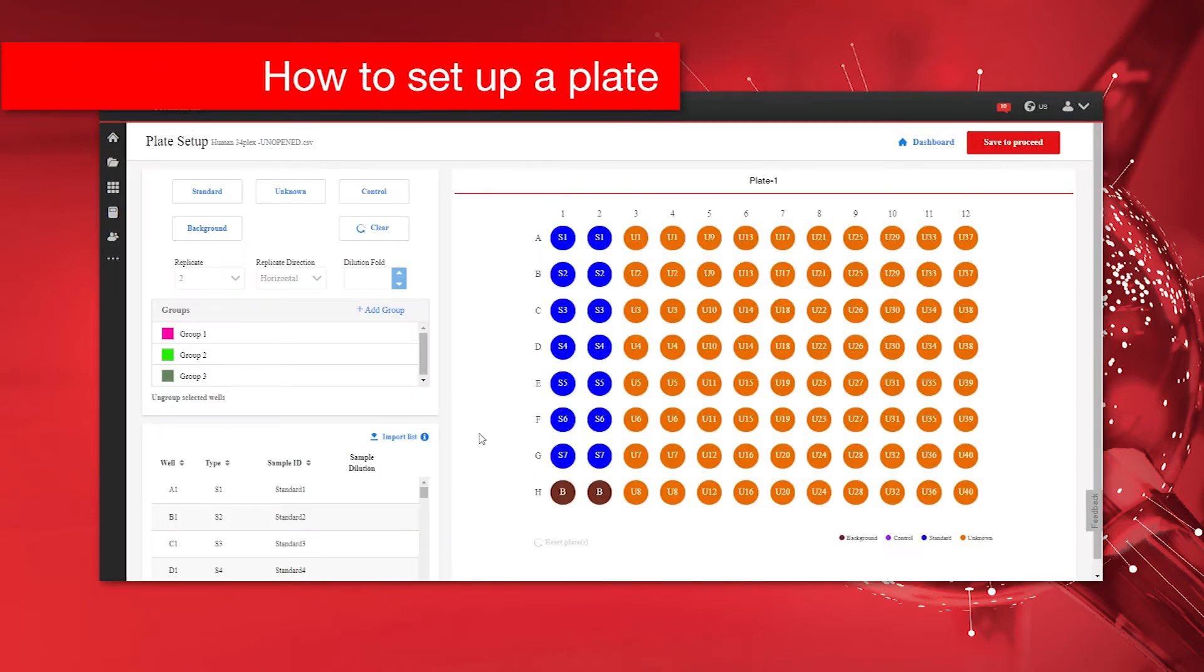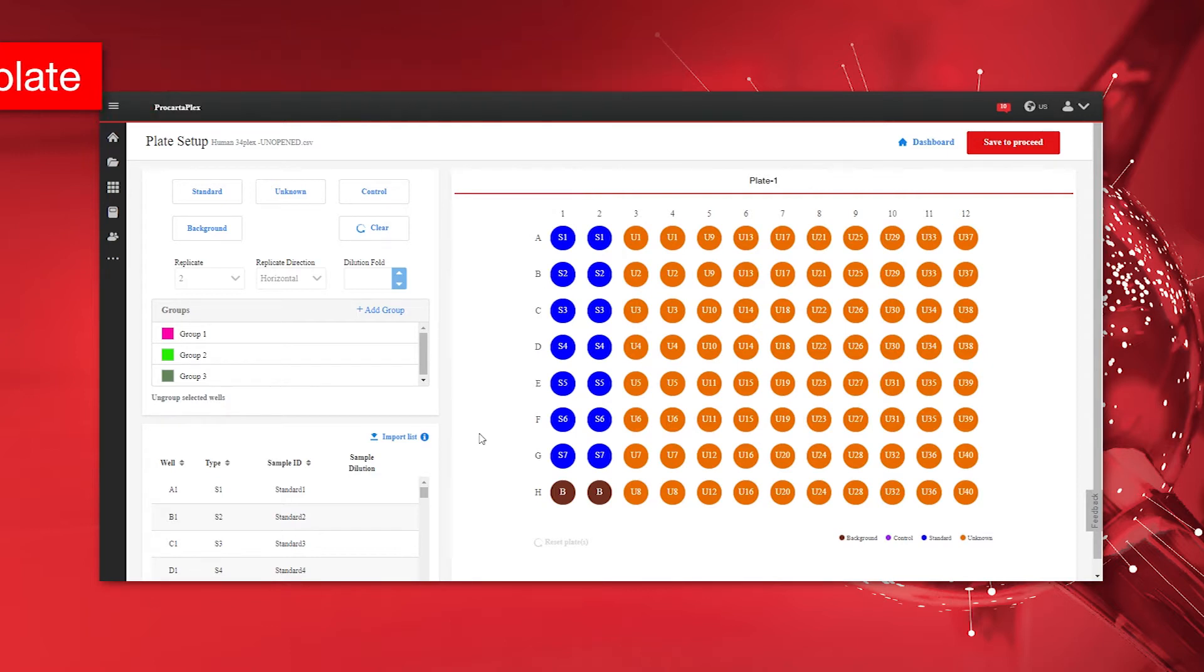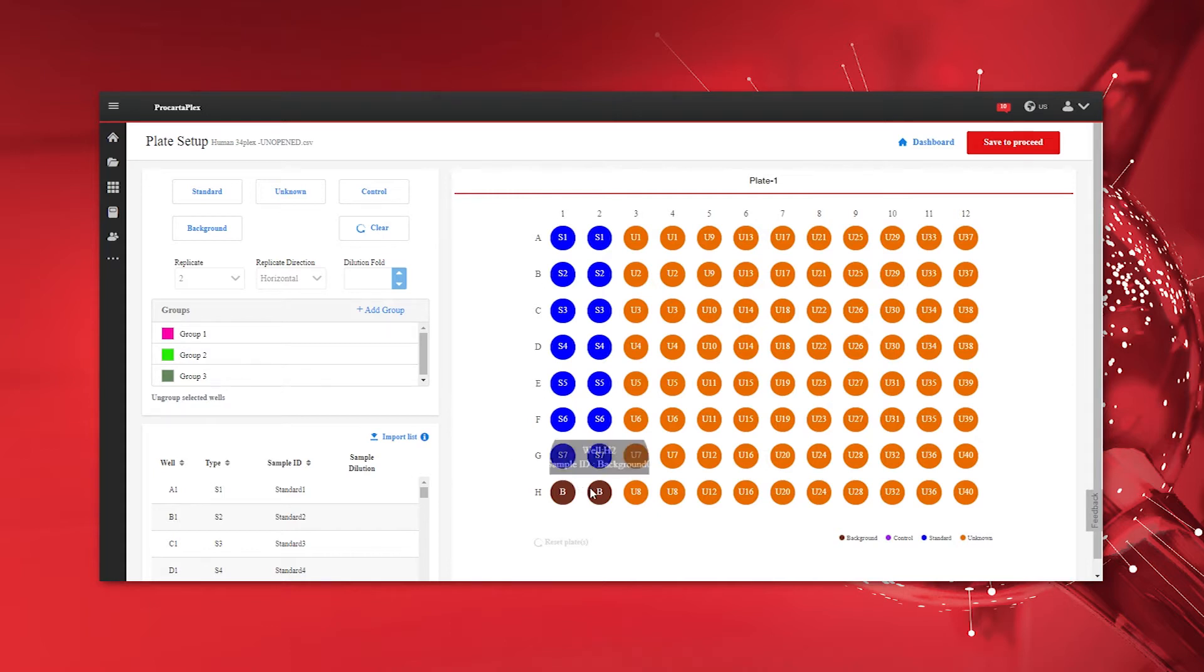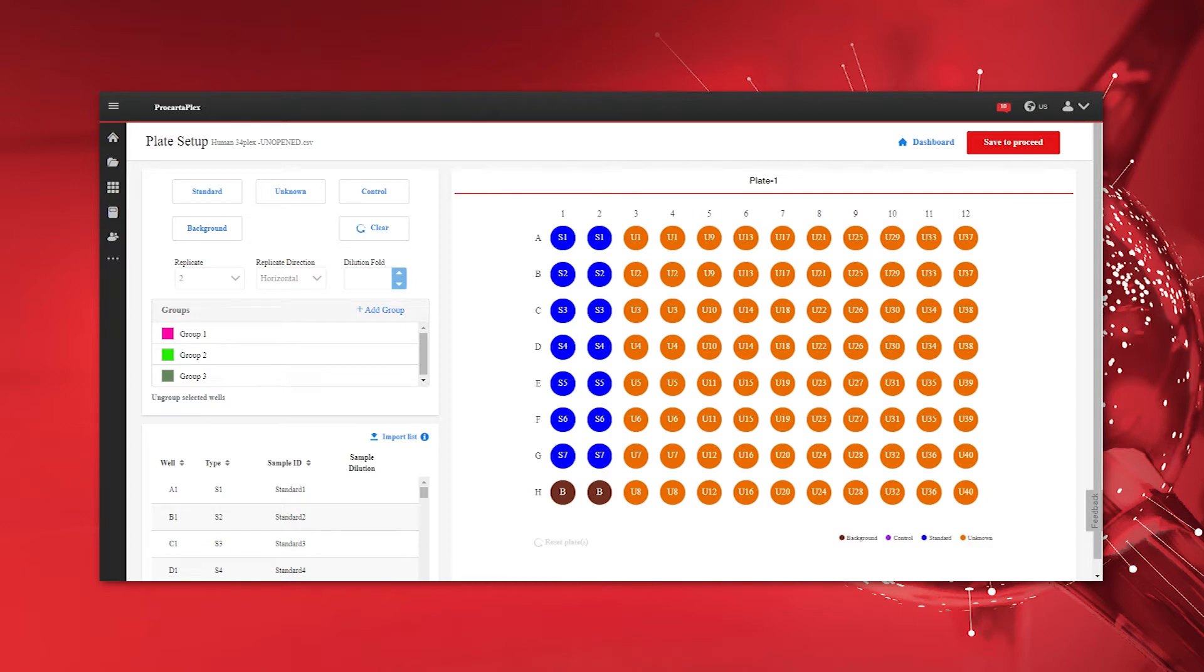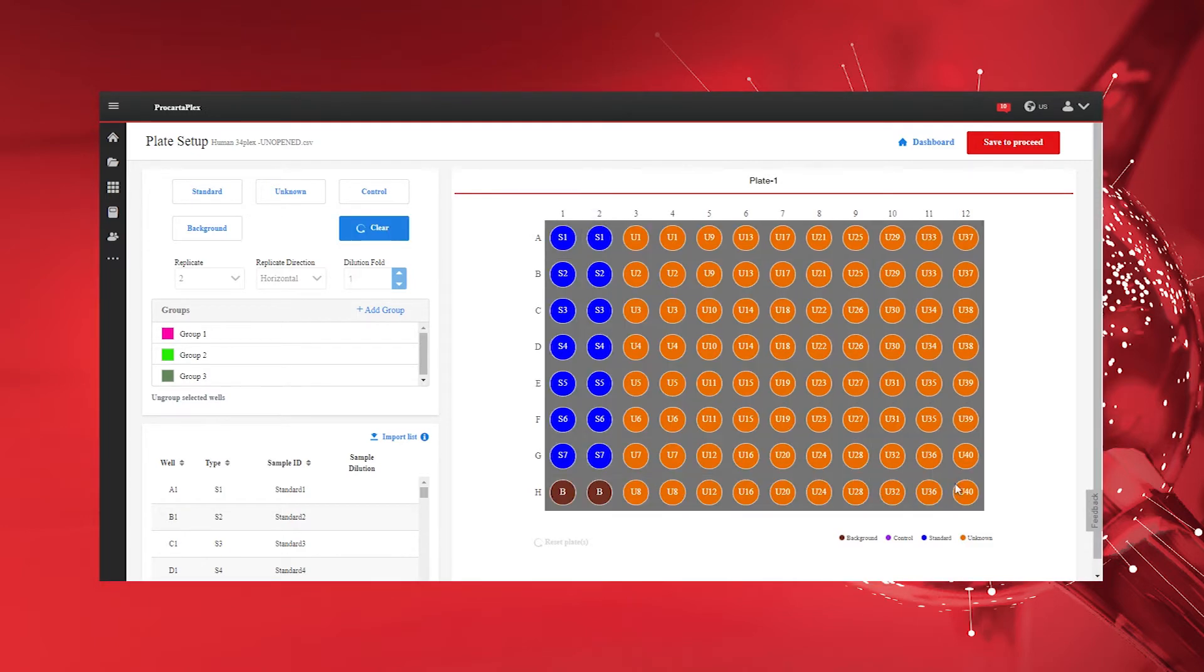The plate setup page allows you to design a new or modify an existing plate layout. Previously designed plate layouts including sample IDs and dilution factors will be automatically imported to the software via the CSV file. Of note, CSV files generated by BioPlex software need manual plate setup.